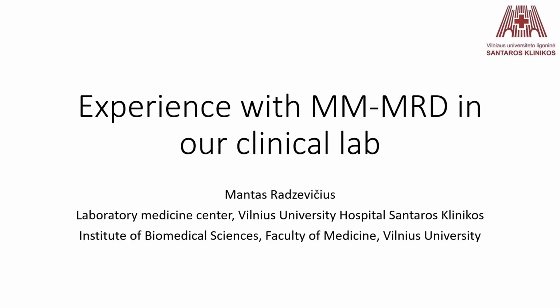So thank you for the introduction. My name is Mantas Radzevičius, and I'll talk about our lab's experience with performing next-generation flow multiple myeloma MRD.